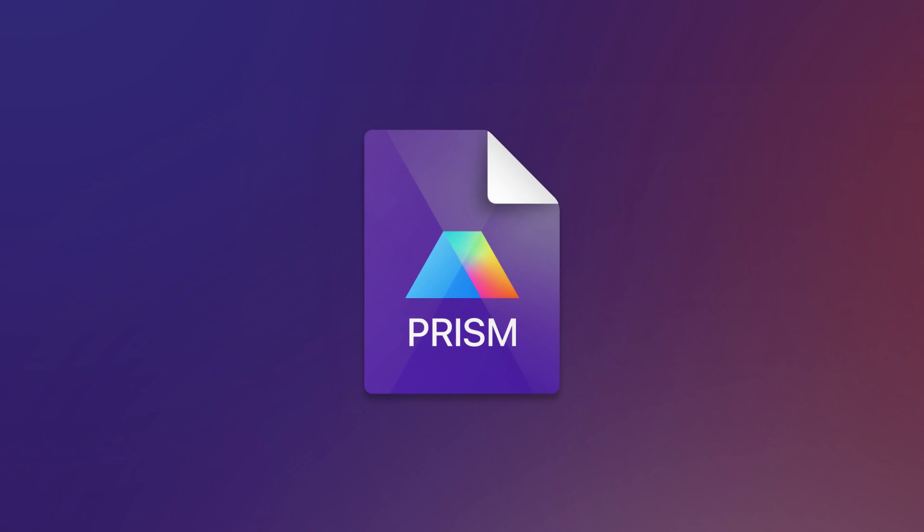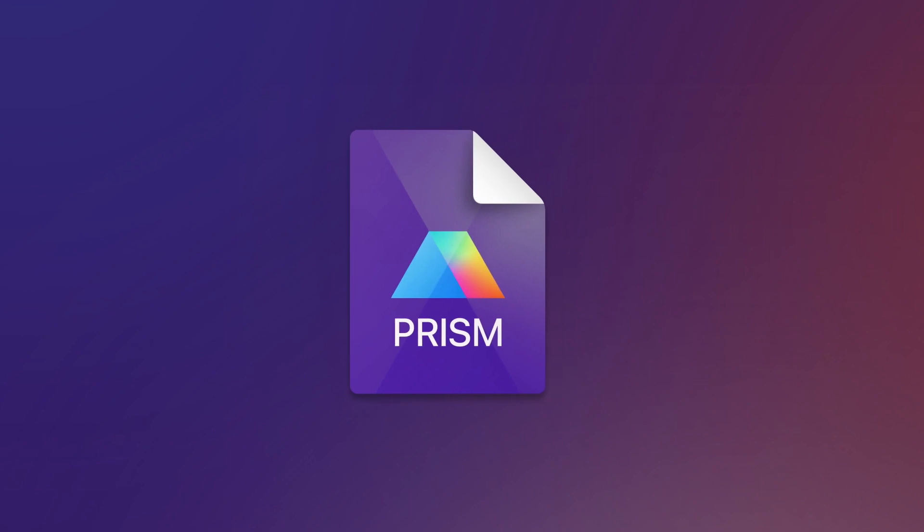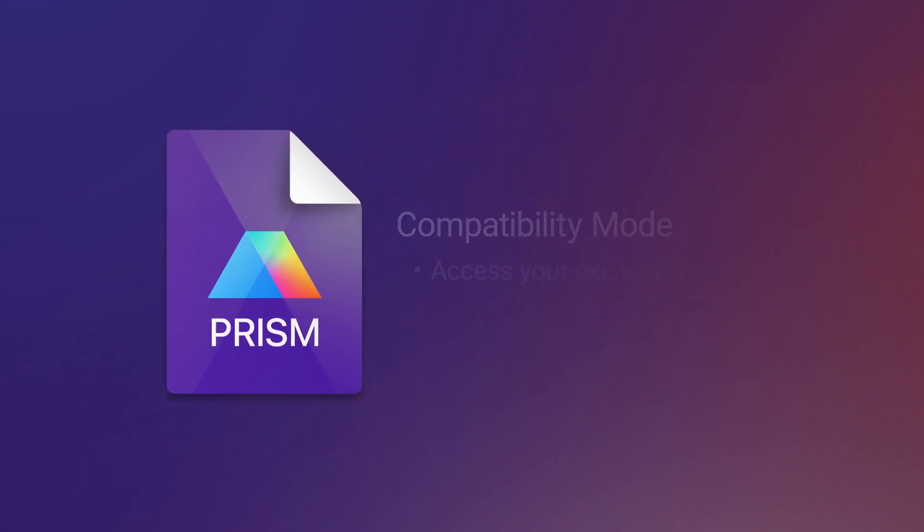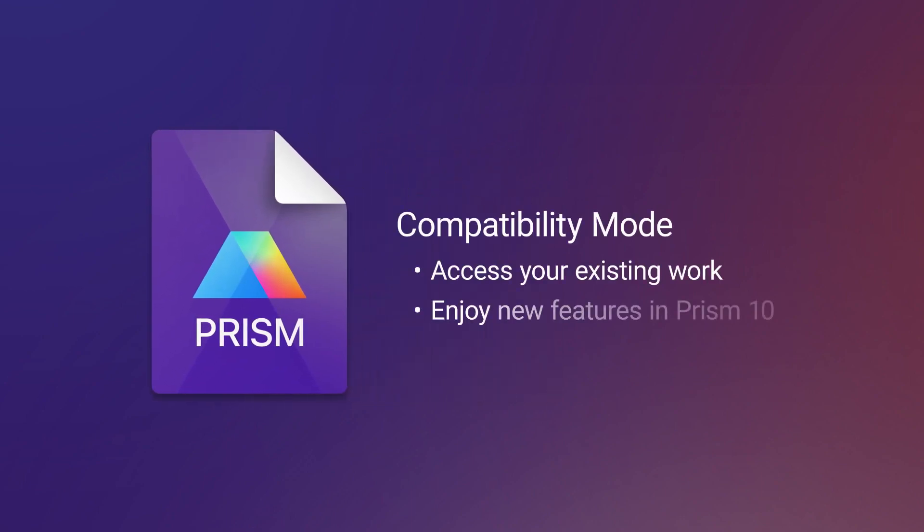Retaining existing work is core to this move. Our compatibility mode allows you to seamlessly transition to using this new file format without losing access to any of your existing work. And compatibility mode won't lock you out of using the new features in PRISM 10 either.